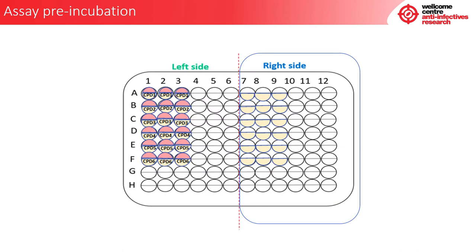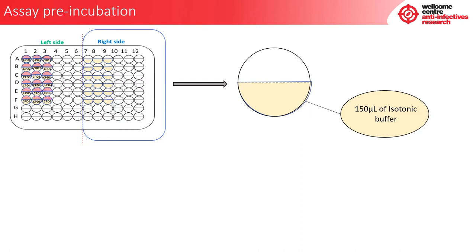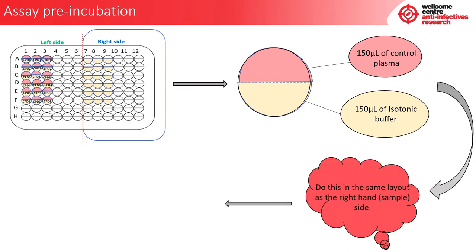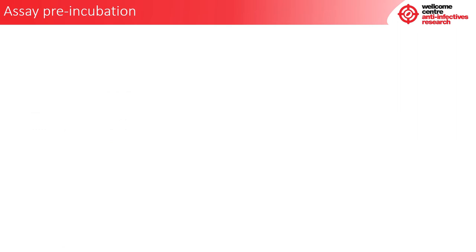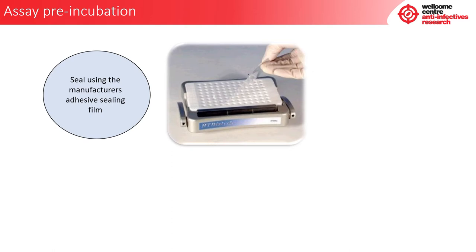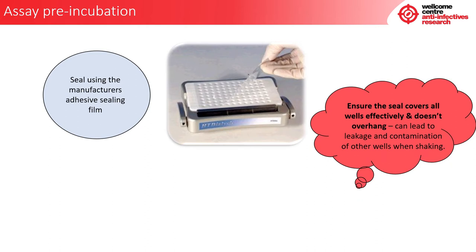Now we are going to deal with the right-hand side of the dialysis block, also known as the control side. On the right side we have 150 microlitres of isotonic buffer in the bottom chamber of each well. We will then dispense 150 microlitres of control plasma into the top chamber of the relevant wells, in the same layout as the sample side. Once sample has been loaded into both sides of the dialysis block, it is now ready to be sealed using the manufacturer's adhesive sealing film. Ensure that the seal covers all wells effectively and doesn't overhang, as this can lead to leakage and contamination of other wells when shaking.